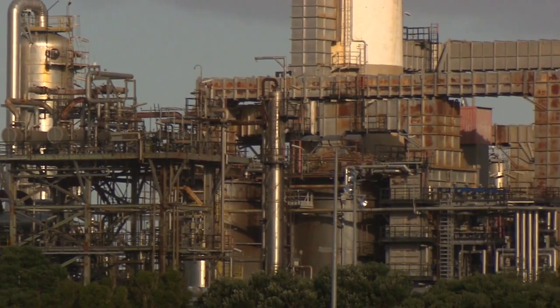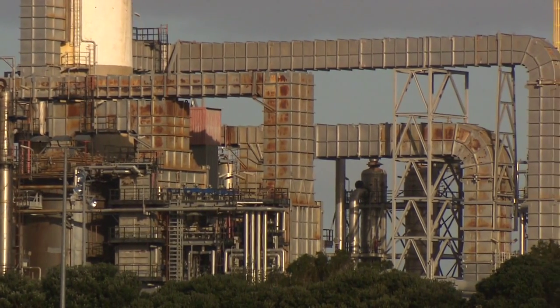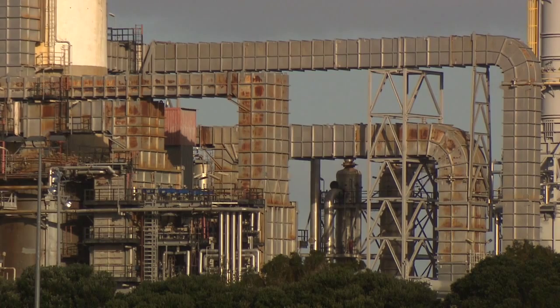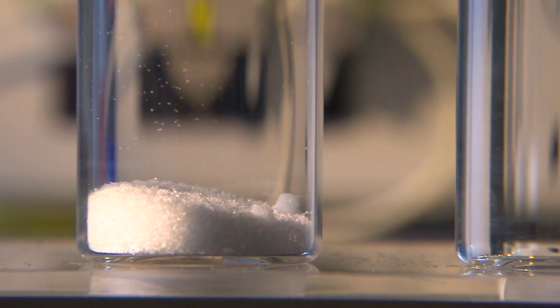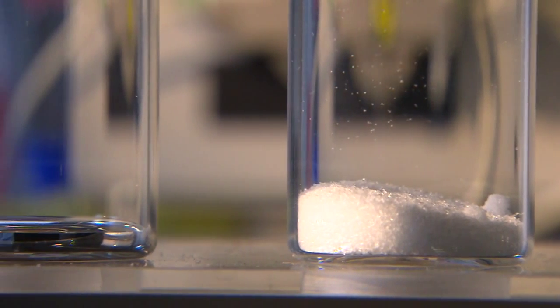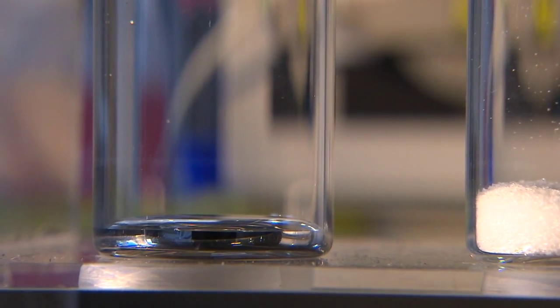Now let's look at who might need to test for mercury. Both the upstream and downstream petrochemical industries need to know the concentration of mercury in their hydrocarbons for both production and HSE reasons. In production area, mercury can cause corrosion of heat exchangers and catalyst poisoning. Generally, the less mercury within a product, the higher its commercial value. Mercury is an environmental pollutant and it's necessary to monitor mercury levels to minimise the levels of mercury released into the environment. So what are the challenges of testing for mercury at very low levels?